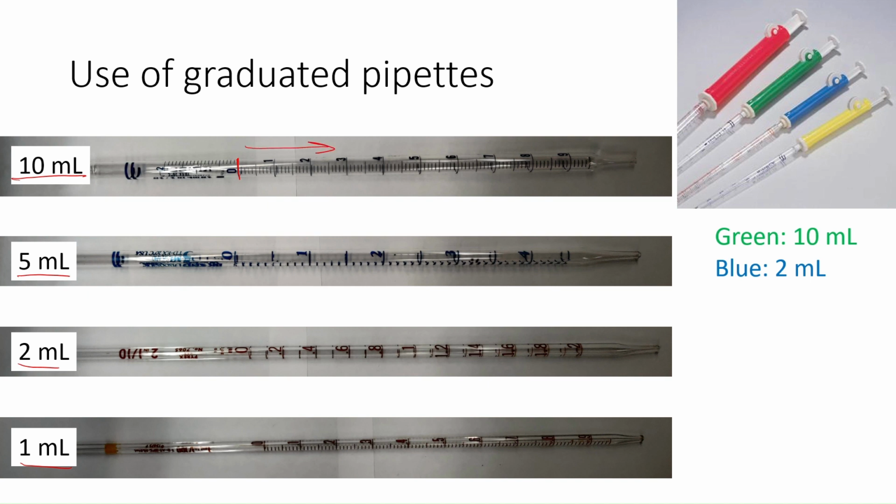So for example, in this 10 ml pipette, if you wanted to measure 4 milliliters, you'd actually have to subtract that desired volume from the total volume of the pipette, which is 10. So if you wanted to dispense 4 milliliters, you would draw up liquid up to the 6 mark, and then you can dispense out that liquid fully from the tip. Again, to arrive at that number, you have your total volume, 10 mls, and then you subtract out the reading, 6 mls, to give you the actual volume that you just measured and dispensed, which is 4 mls.